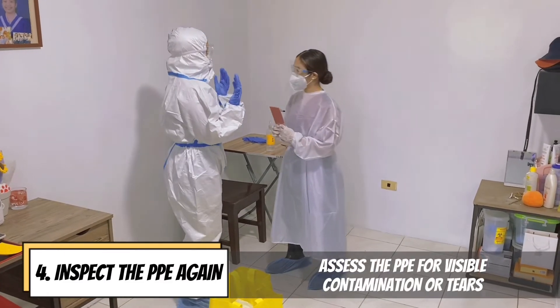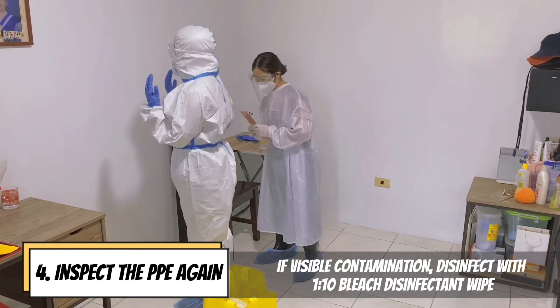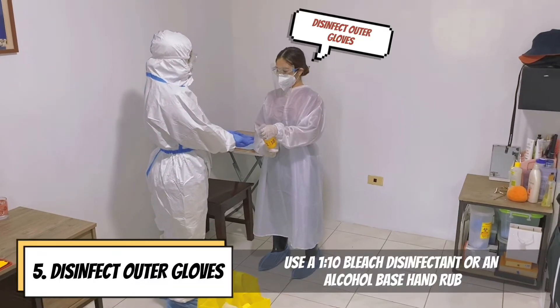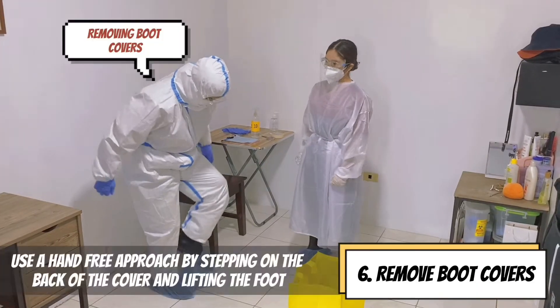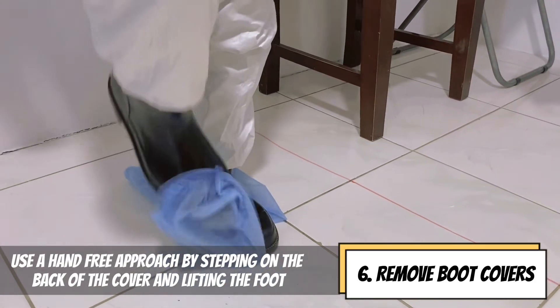Inspect the PPE again and assess for visible contamination or tears. If visible contamination, disinfect with 1-to-10 bleach disinfectant wipe. Disinfect outer gloves using a 1-to-10 bleach disinfectant or an alcohol-based hand rub. Remove boot covers using a hands-free approach by stepping on the back of the cover and lifting the foot.